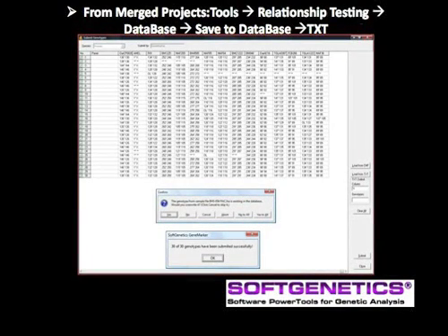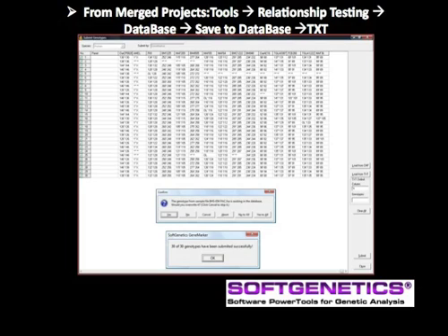Now let's compare the database search results for the same samples after merging the projects and using 15 loci compared to the 5 loci of the previous sample. In relationship testing, select Database, Save to Database, Load from Text, import the marker table saved earlier in merged projects, and then click Submit and OK.